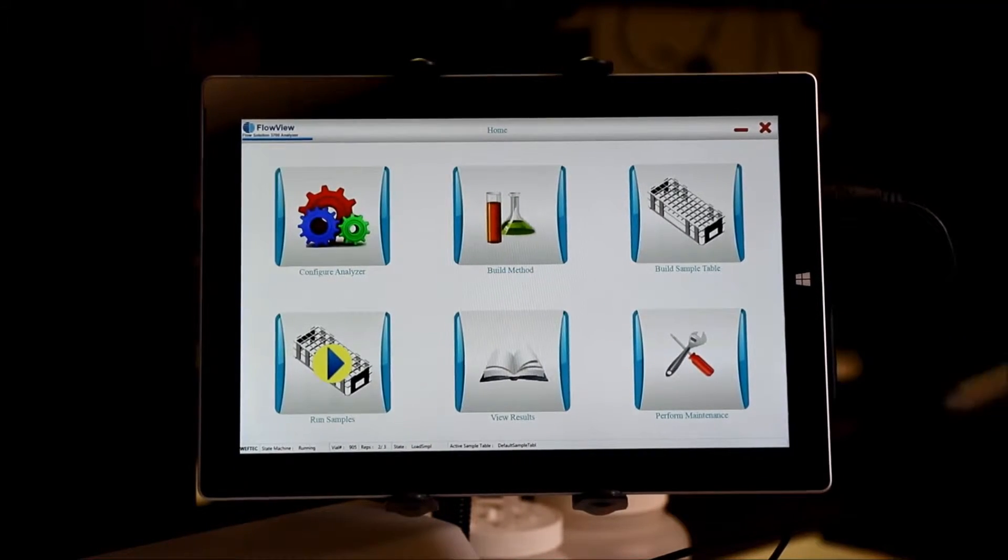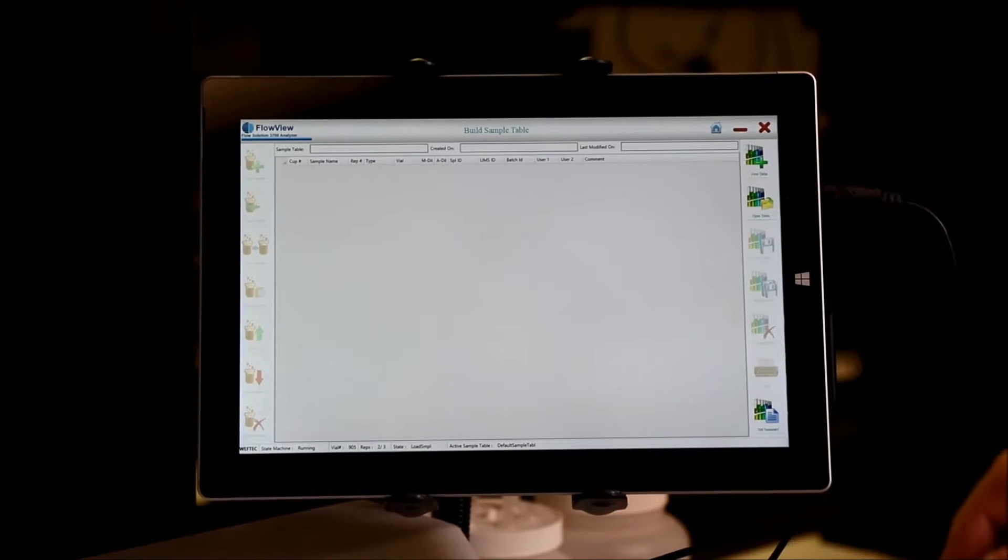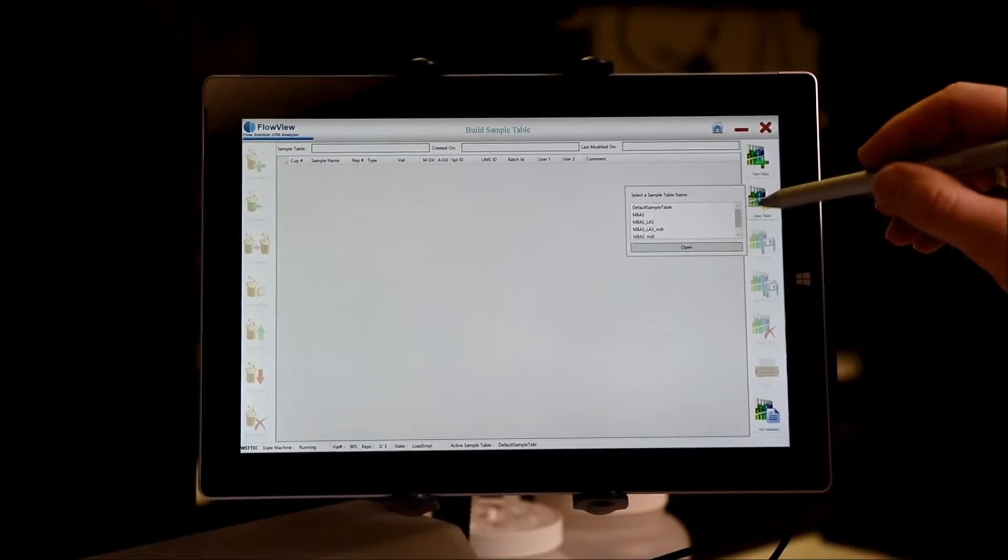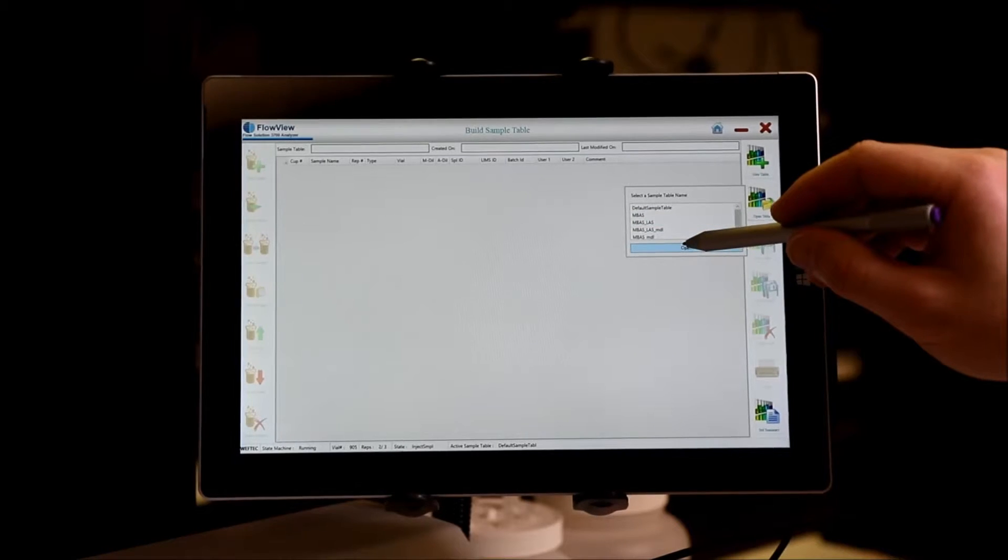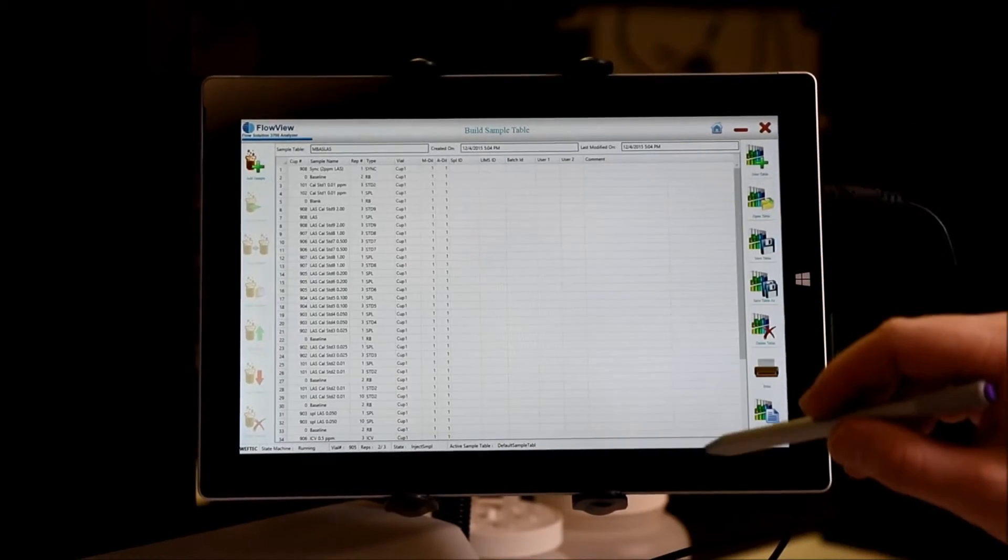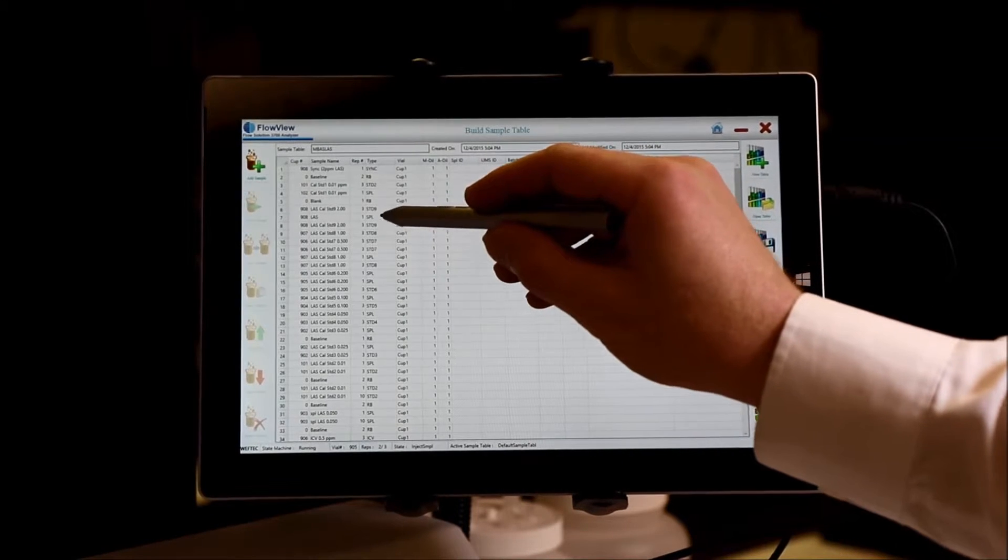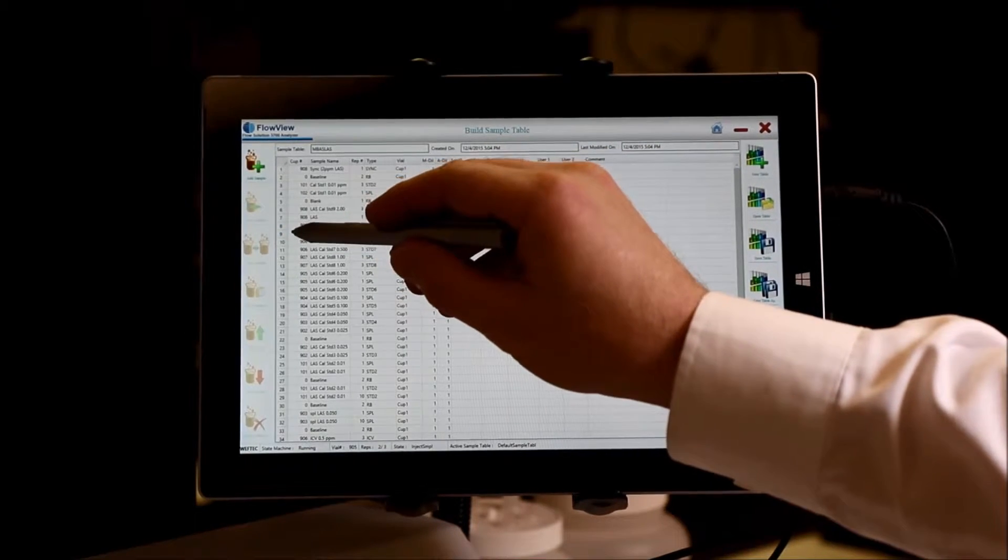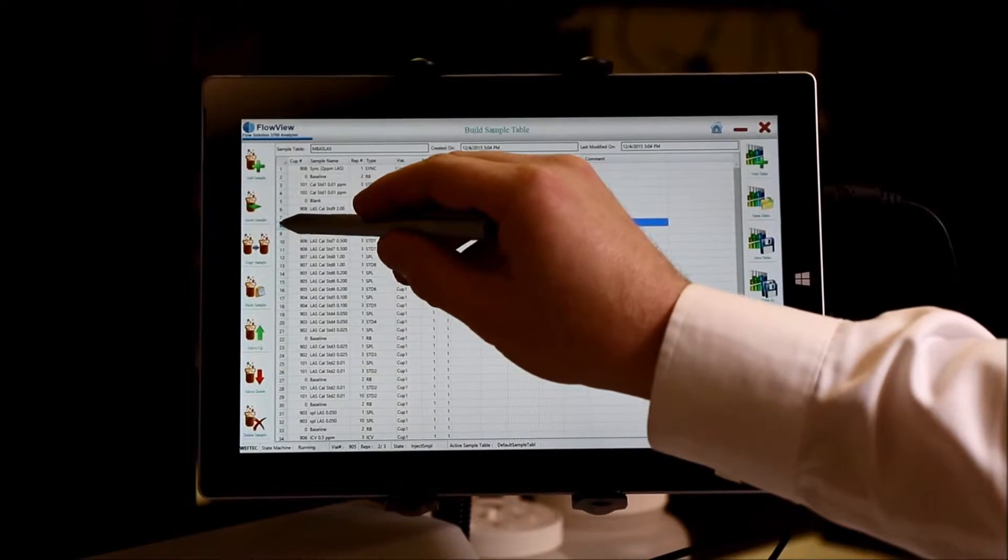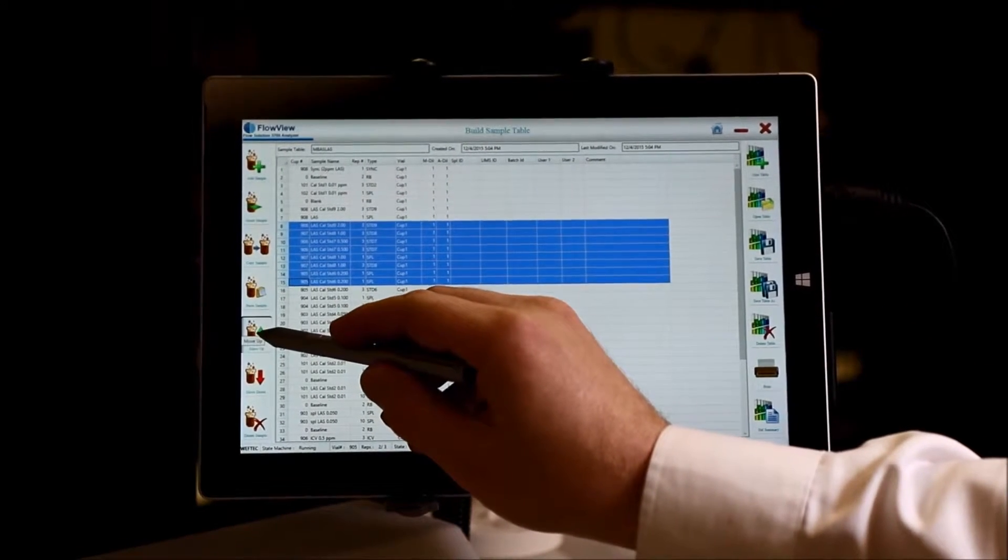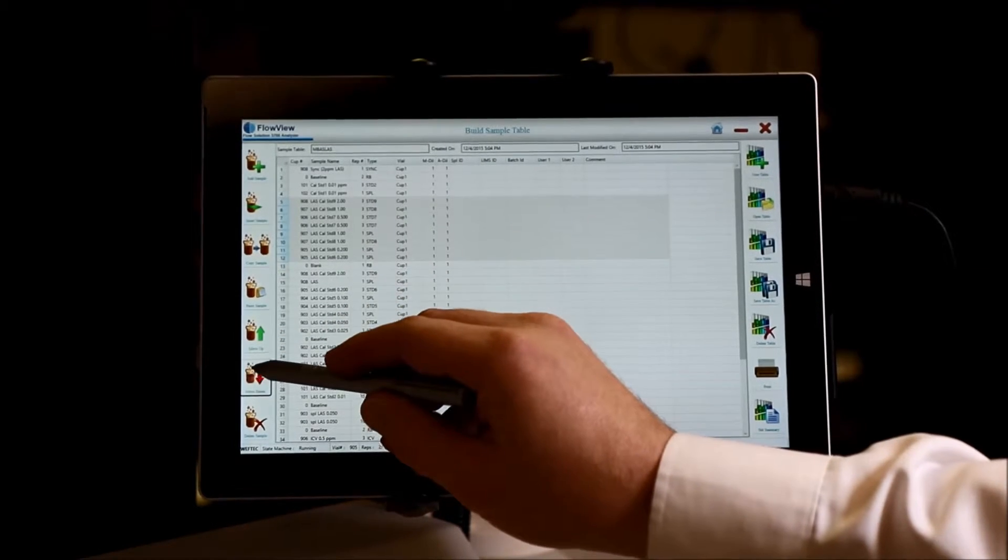Next you set your sequence using build sample table. From the screen, you can create a new table or use one of the templates or prior runs that has been utilized. Set your standards and samples, select one or more rows, and each of those rows can be moved together as a group.